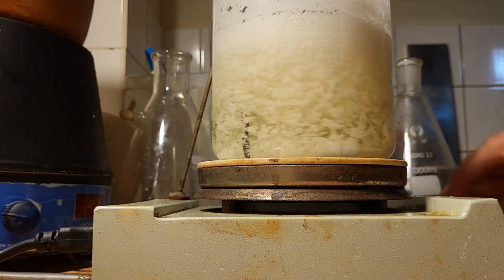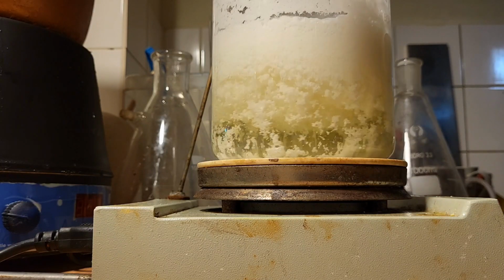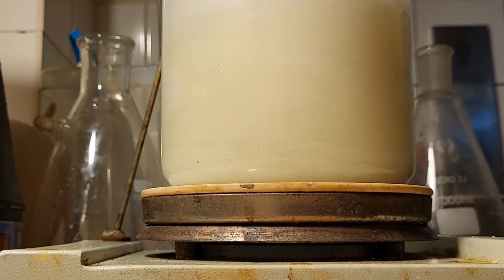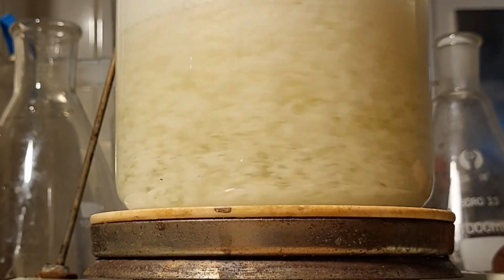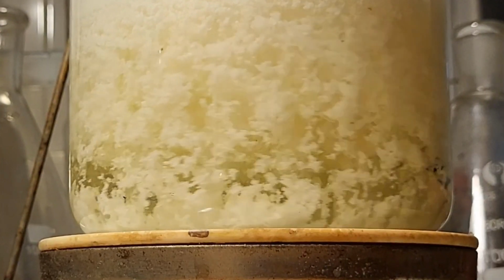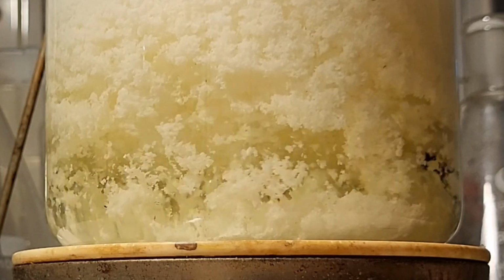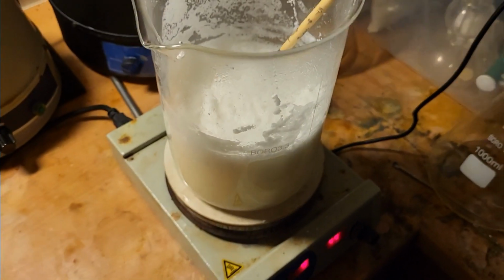It's slowly dissolving. It's also taking quite a while. We don't want to use too much water.